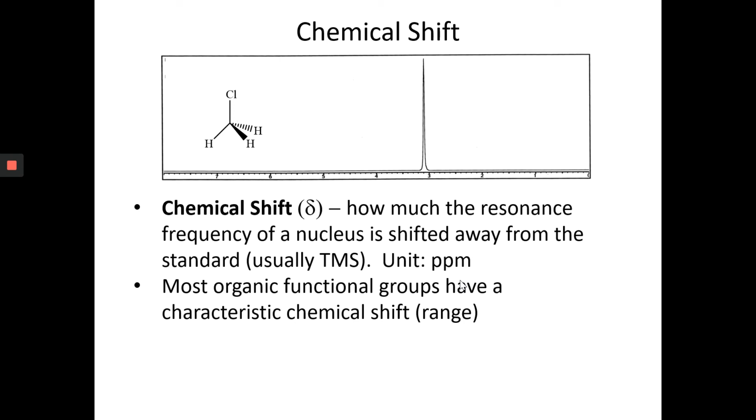And if you flip over to the back of that table, it's the exact same information, but I organized it in a different way. On the back, I sorted it by chemical shift from small to big. Sometimes that will help you find something. If you have a signal between, say, 3.5 and 4, and you wonder what it could be, the back can help you. But I will caution you that the back is not comprehensive.